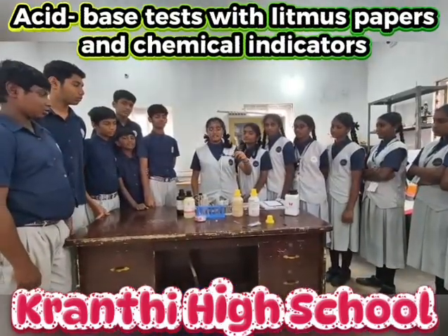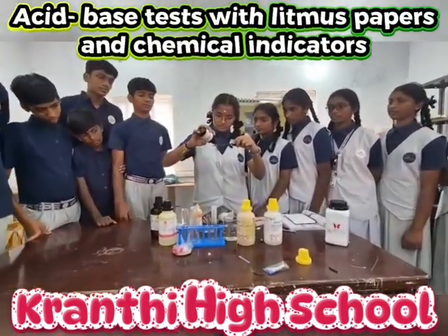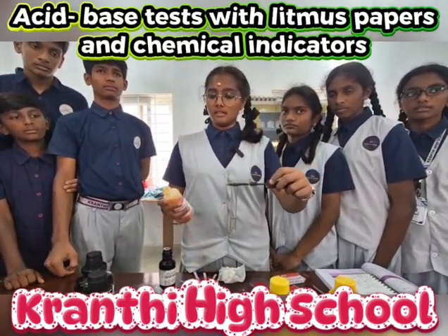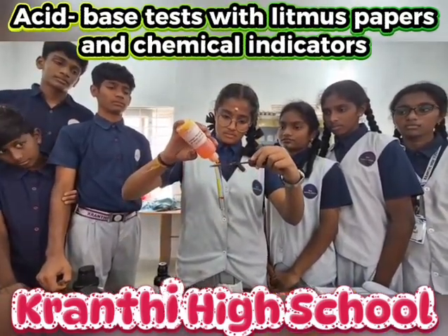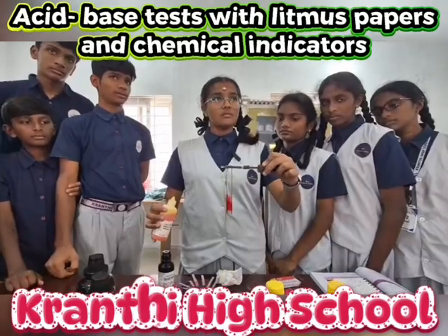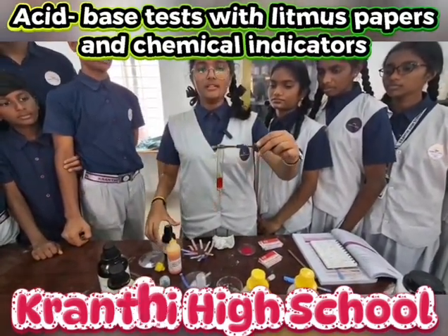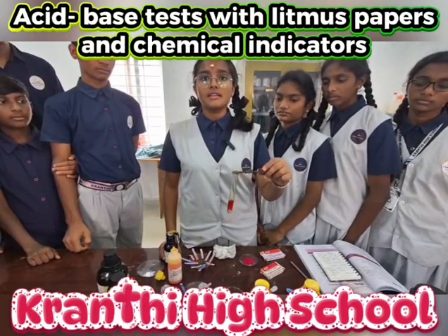Now we are testing acetic acid. Now we are adding phenolphthalein indicator to it. As you see, the acetic acid solution did not change its color. Now we are adding methyl orange to it. Now you see that the acetic acid solution has turned its color into red. Now we can consider it as an acid.